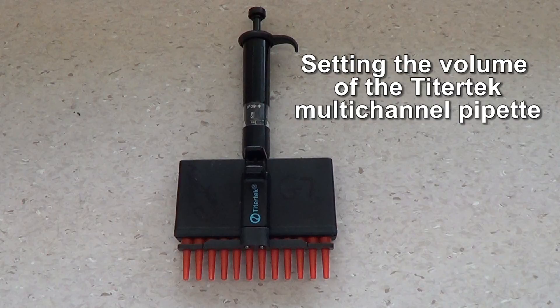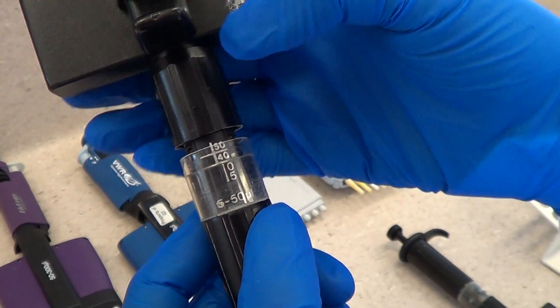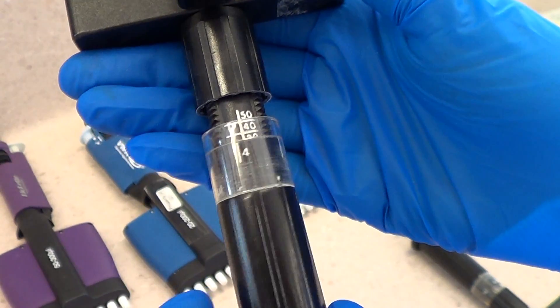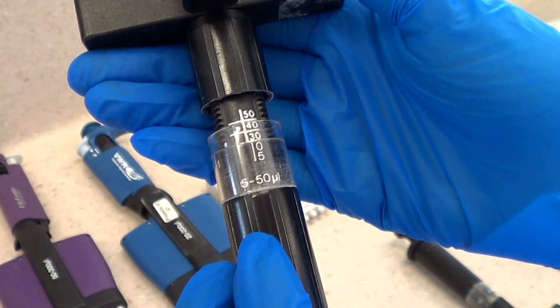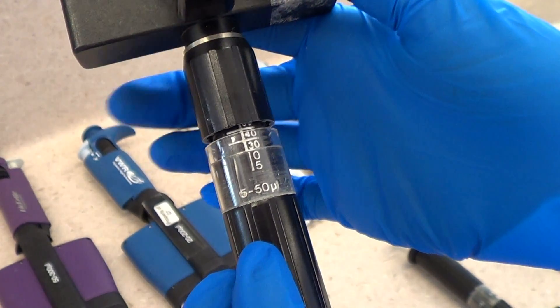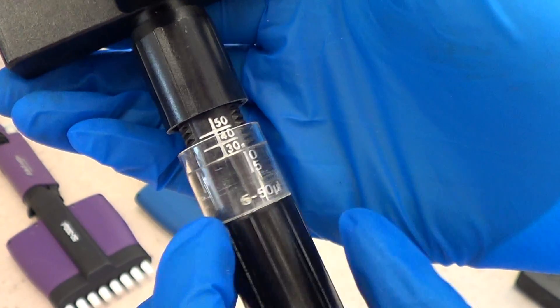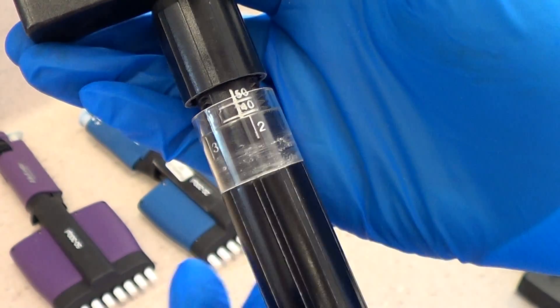Setting the volume of the Titertek multi-channel pipette. Loosen the top section, then screw or unscrew the lower section until the edge lines up with the required volume. Then tighten the top section. This pipette is set to 30 microliters. Note that each full turn decreases or increases the volume by 5 microliters.